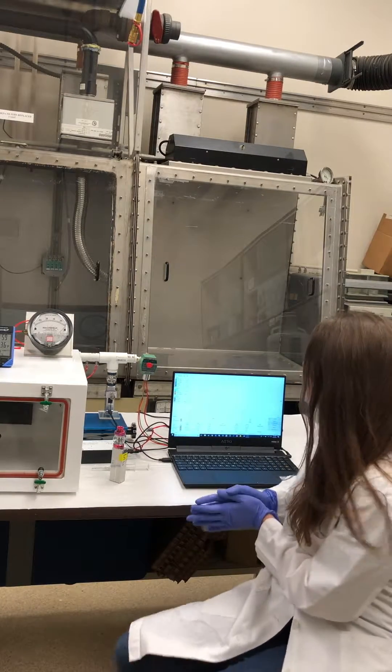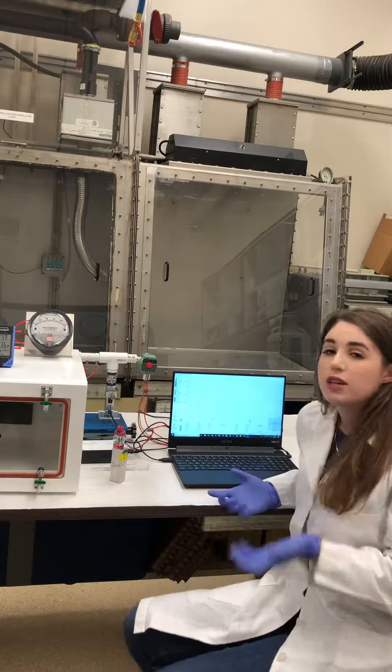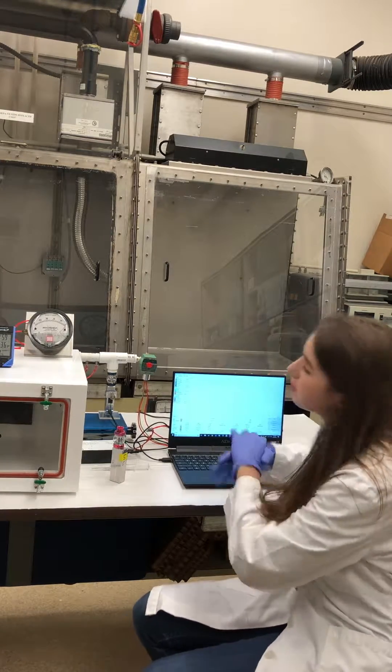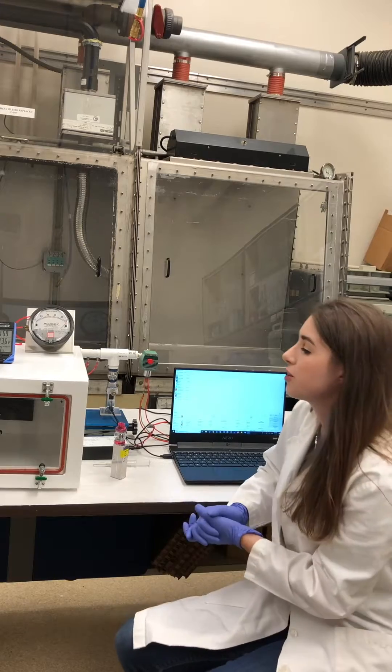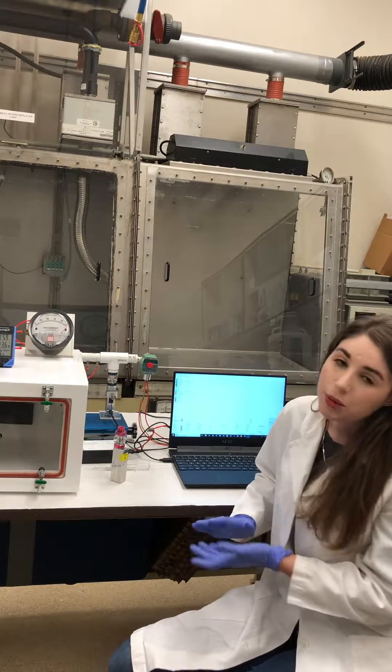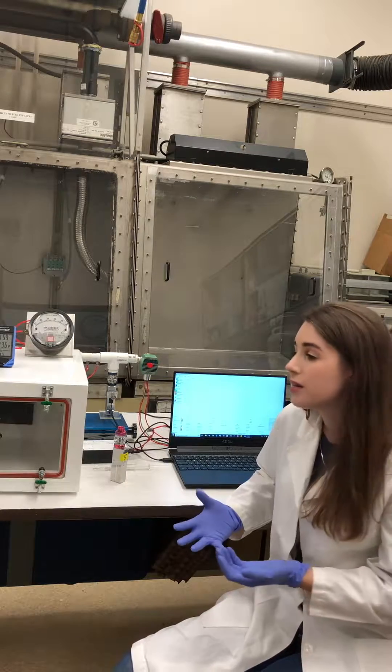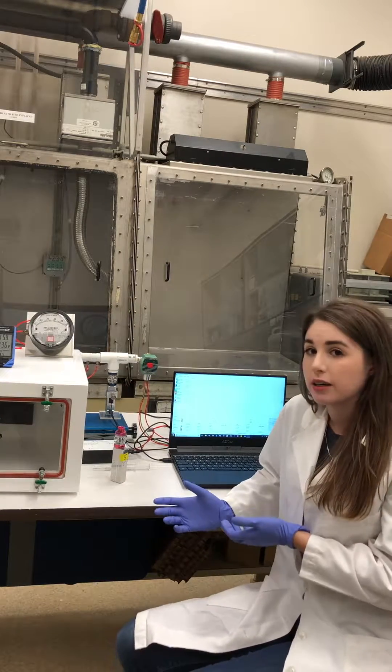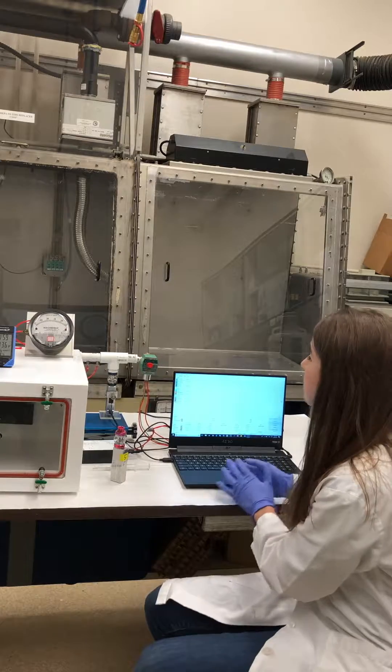We have this really interesting, unique tool. We've built this vaping system in order to expose different animal models, different types of cells, to vapor directly. So I can show you guys basically how that works.